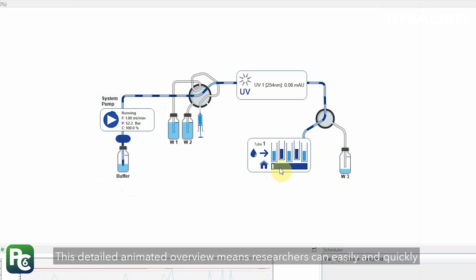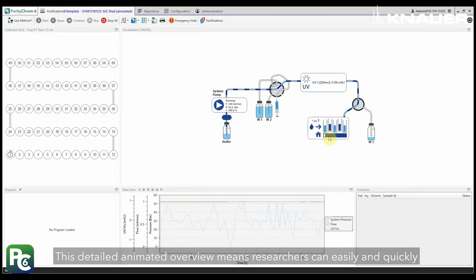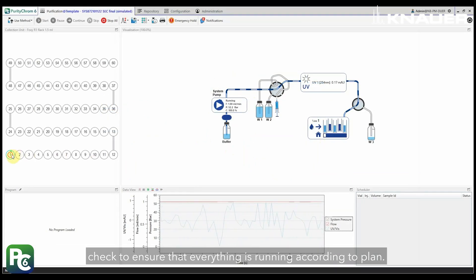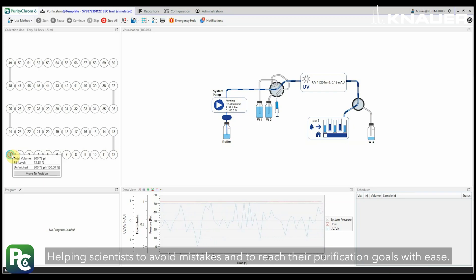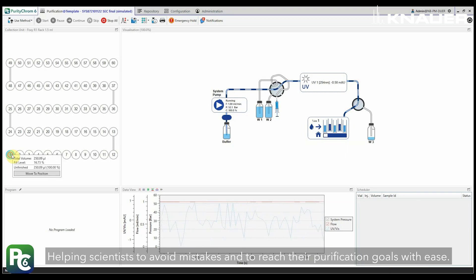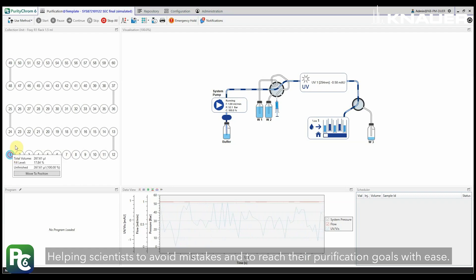This detailed animated overview means researchers can easily and quickly check to ensure that everything is running according to plan. Helping scientists to avoid mistakes and to reach their purification goals with ease.